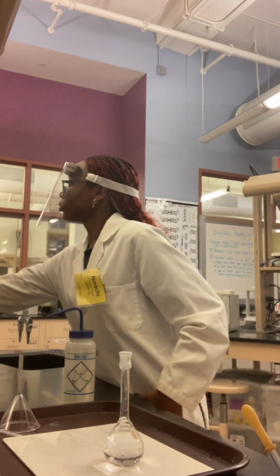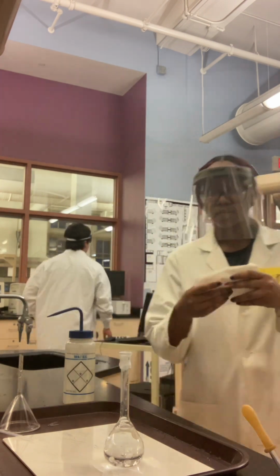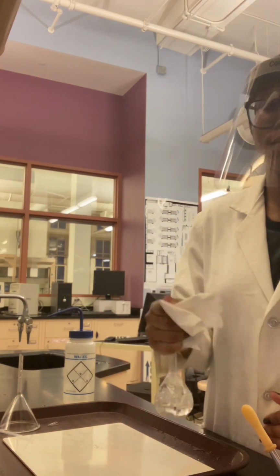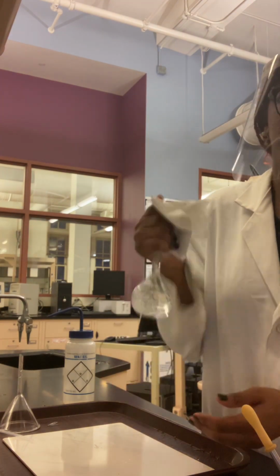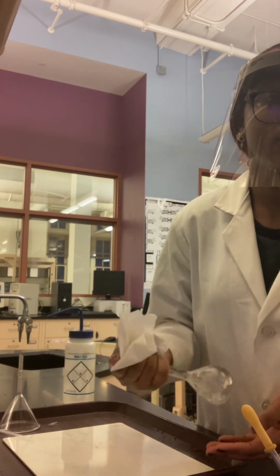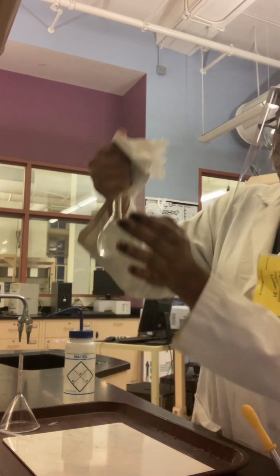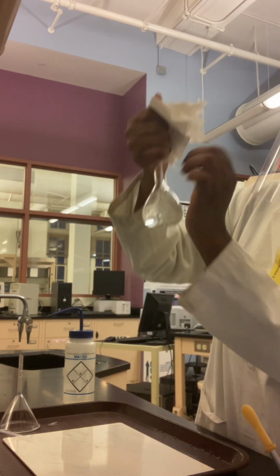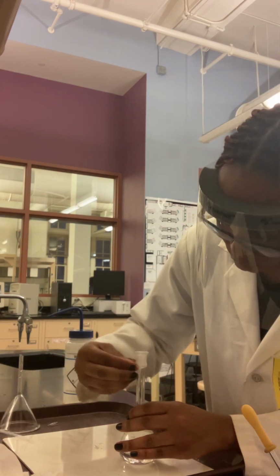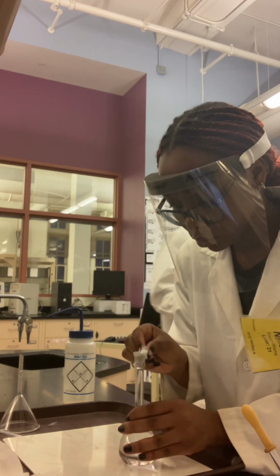So once it's covered, I will mix thoroughly while ensuring that there are no bubbles in the flask. At this point, I will tap the side of the flask to make sure there's no bubbles.